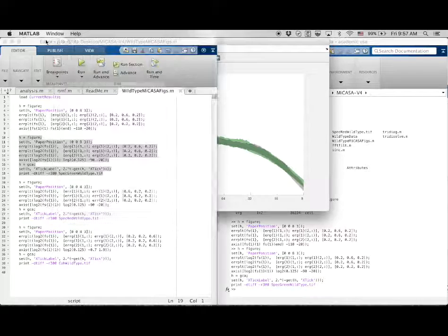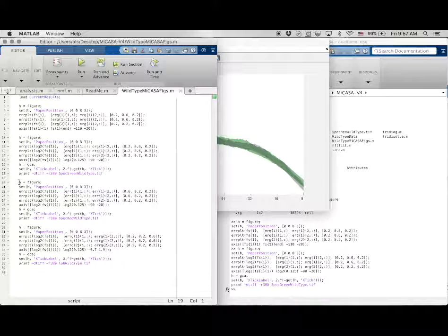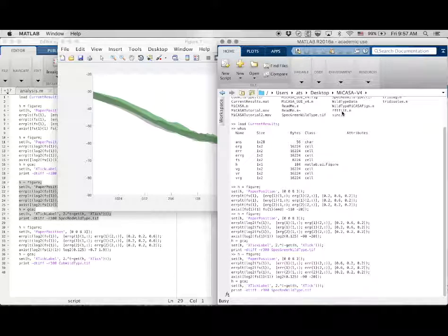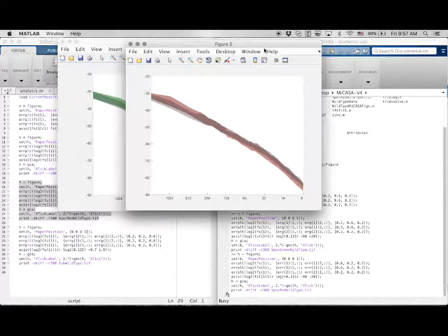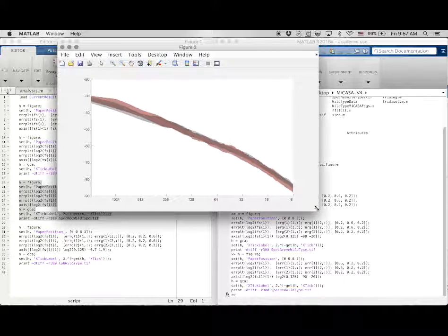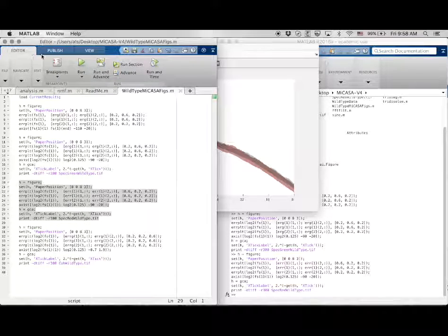Okay, and I'll just show you how the rest of the data looks using this type of plot. So this is the red fluorophore, and its circularly averaged spectrum. Again, we just plotted over the biologically relevant length scales, and you can see that, of course, it lies on top of each other. And then here, we'll do it for the coherence as well.